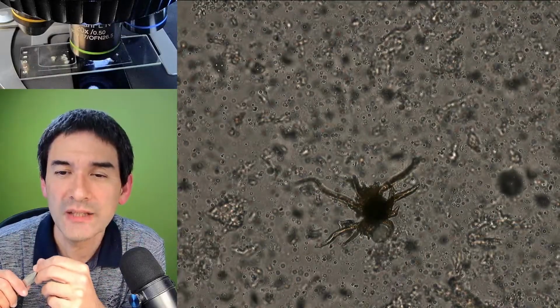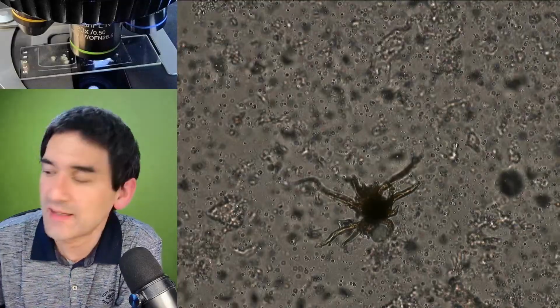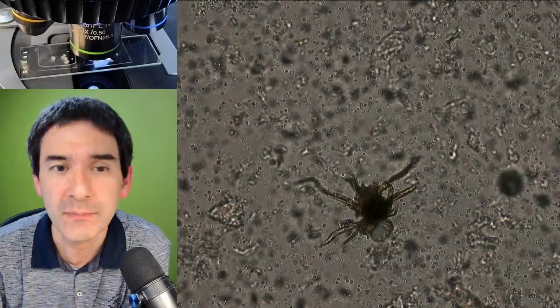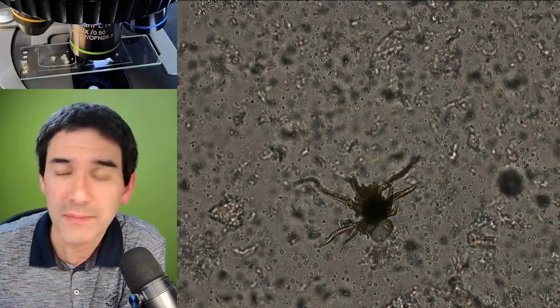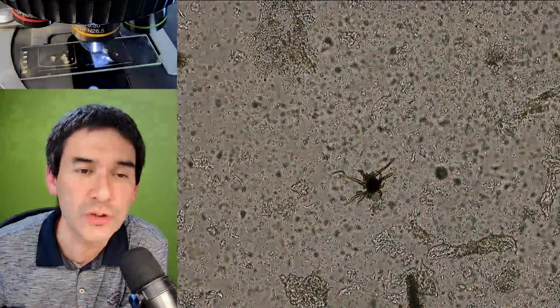Can you mention Nile red to identify plastics? Nile red is a stain. It is a hydrophobic stain. I've not used it yet. There's also a YouTube channel called Nile Red, but Nile red actually is a stain which is fluorescent. If you stain a sample with Nile red and you use UV light, then the microplastics will actually start to shine.